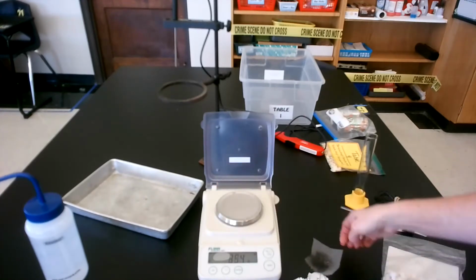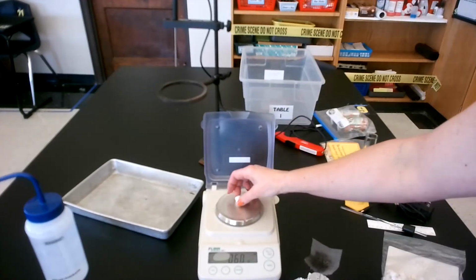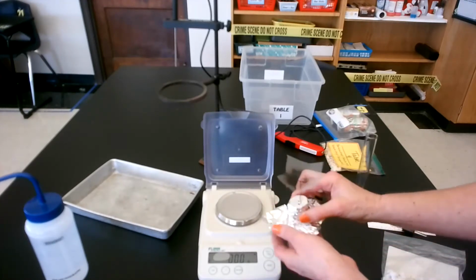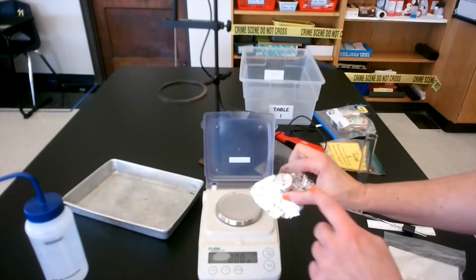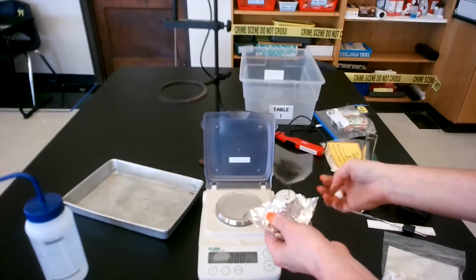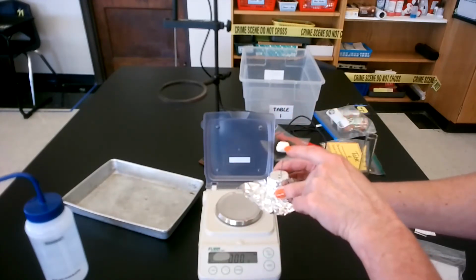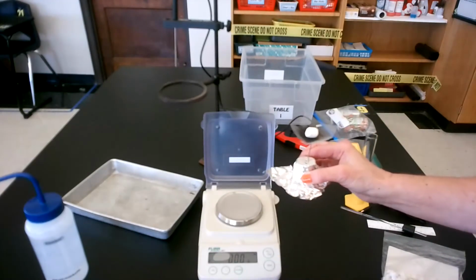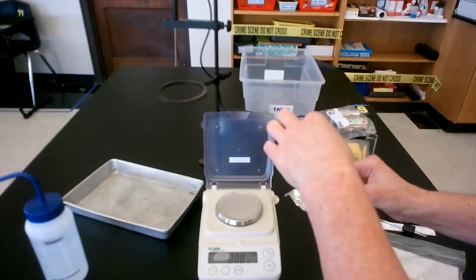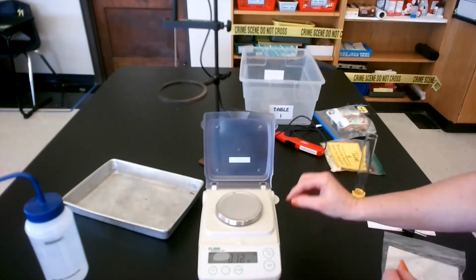The reason why, yes, I could just put this on there and find the mass of the food. However, after we're done burning, I need to find the mass of the food. Some of that food is going to stick to the screen, and then I'm going to miss that mass because these balances are very sensitive. That's why I want to include the food holder, because if any food is burnt and stuck to this, then I can subtract the food holder again, and then I have the mass of the food. Hopefully that makes sense.